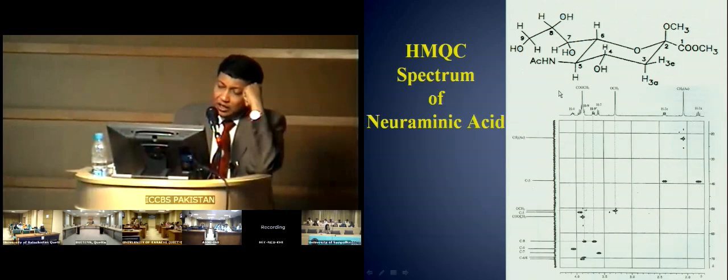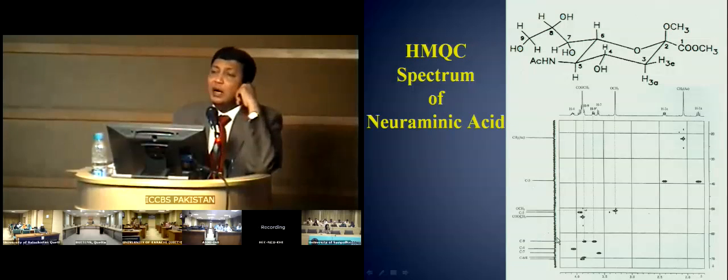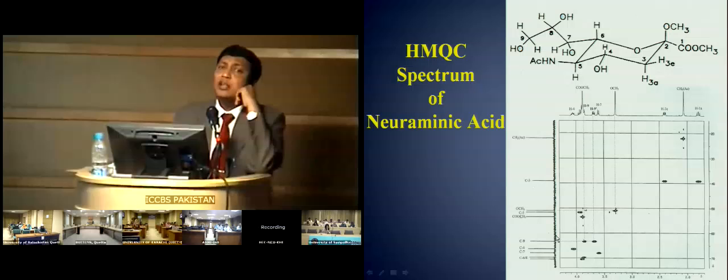So you are capable of spreading this proton NMR spectrum with reference to the labeled carbon, and that's how you detect the carbon through their effect on proton. Through their effect on proton.